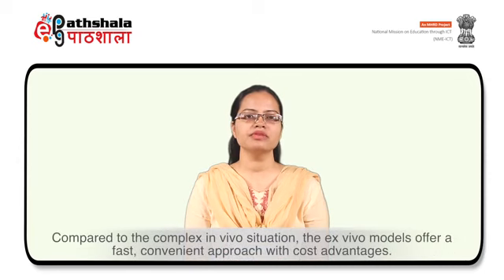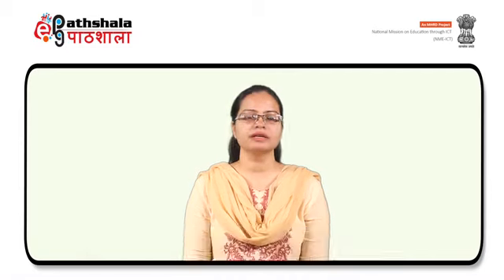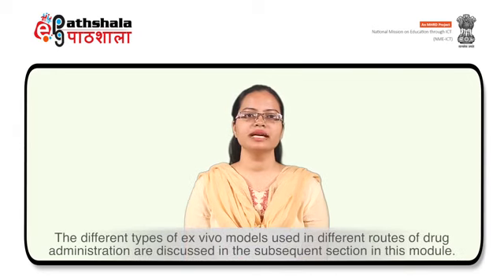Compared to the complex in vivo situation, the ex vivo models offer a fast, convenient approach with cost advantages. Most importantly, they can be standardized and automatized to be applicable to high throughput screening. The different types of ex vivo models used in different routes of drug administration are discussed in the subsequent sections in this module.